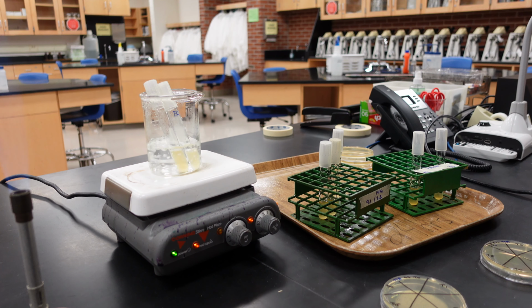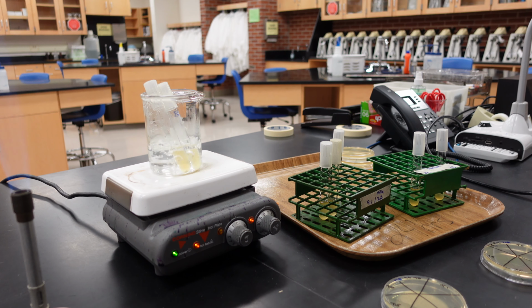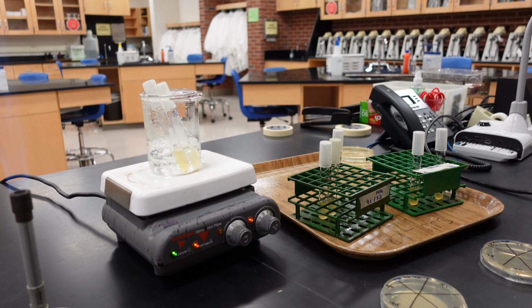I now have E. coli going at the same time. It will sit in there for 1 minute, another minute, for 2 minutes total, 3 minutes total, 4 minutes total, and 5 minutes total. So I'm going to do E. coli a little bit different just because I know E. coli doesn't really like the heat.